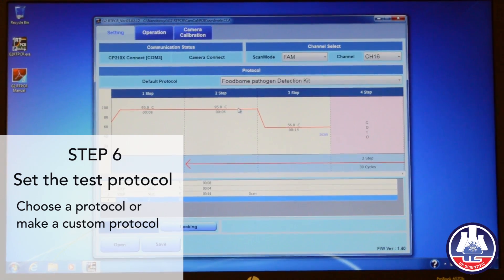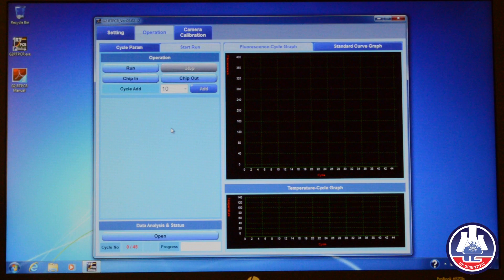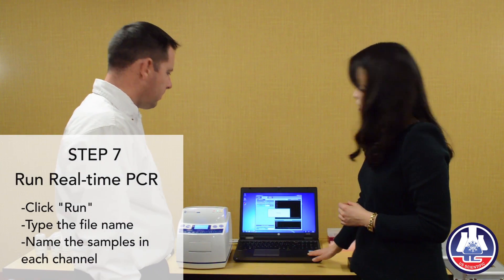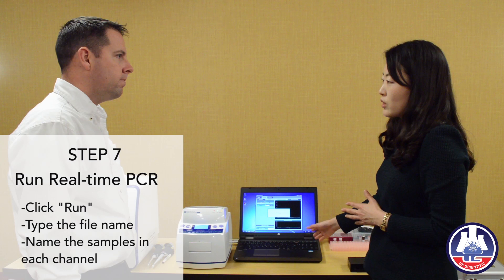When it's all ready, go to the operation tab and click the run button. Make a new folder anywhere you want, put your sample name, and now it starts. It takes around 70 minutes for this kit.